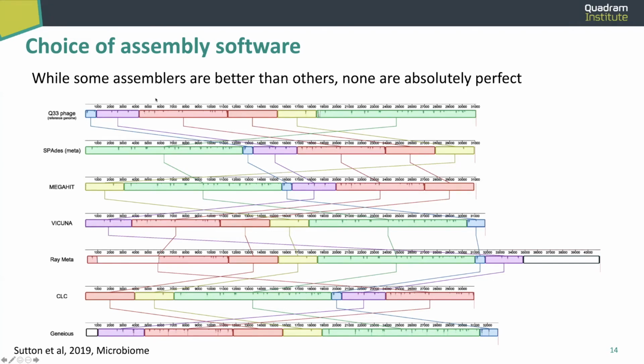So what you can see here is that these blocks are collinear blocks of shared sequence identity. The collinear blocks are collinear everywhere, but the assembler will randomly start at a certain base, and that can be different for each assembler.